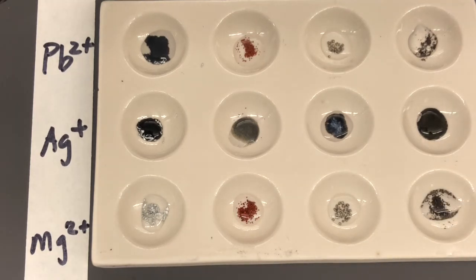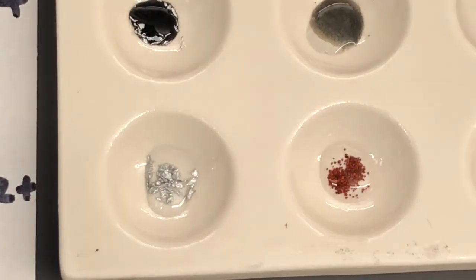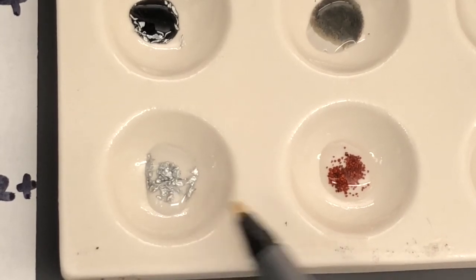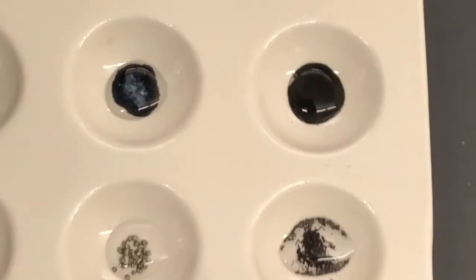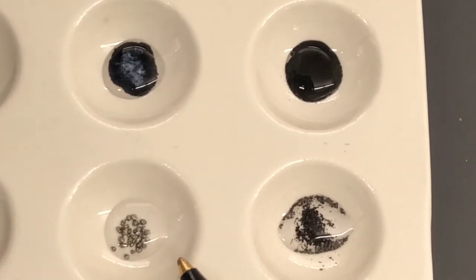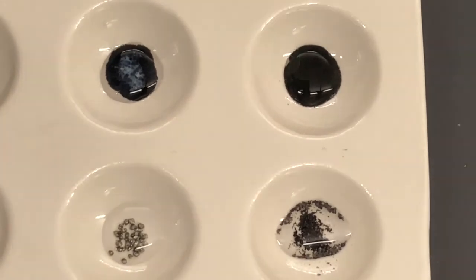All right, so we'll zoom in one last time and talk about these one at a time. The magnesium reacted with zinc. Doesn't really appear like it has much of a reaction. The magnesium 2+ with copper doesn't appear to have much of a reaction. The magnesium 2+ when reacted with tin doesn't appear to have much of a reaction. And the magnesium when it's mixed with iron doesn't appear to have much of a reaction.